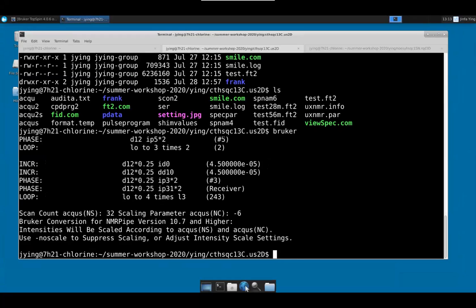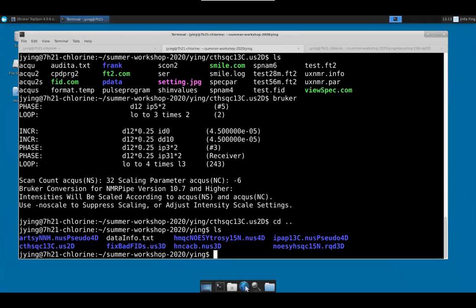Okay, so as I said, I have a list of examples for all the data sets. And from there, you get some idea what we're going to cover. But I'll walk through one by one, until we're running out of time. Some of the reconstruction may take long. Even the 4D definitely takes a long time, so I suggest that you not run them. Some of the 3D could take a half hour as well, because almost all of them are high resolution and very big matrix. So some quick ones take a few seconds to a few minutes.